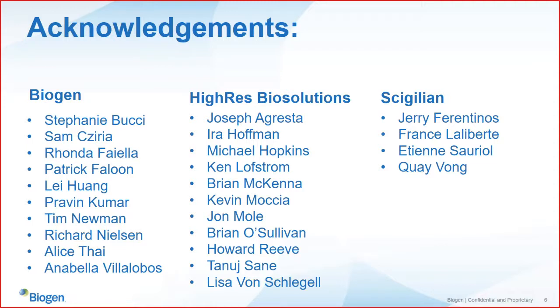I'd say the last question would be, what happens if there is insufficient quantity of sample? Oh, good question. So the first thing that would happen is you wouldn't be able to place that request. It would notify you at the point where you're in the Sigillian store, making that initial request. It would tell you that there was insufficient sample, and then you could remove that compound from the order.